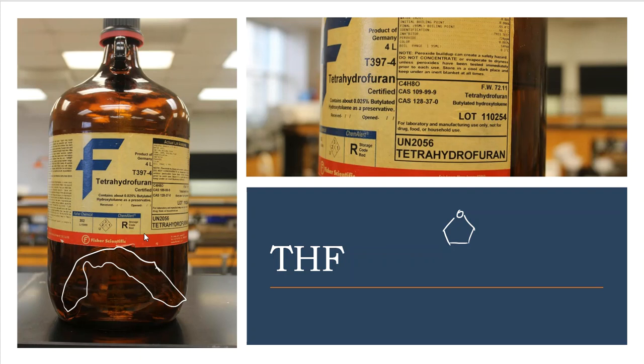Tetrahydrofuran, THF, came from Fisher Scientific, and the lot number, of course, is up here to the top right-hand side for you, so that way you can write that down when needed. The lab directions did do a pretty good job. They told me how much of this stuff to weigh out, or to use, or to measure. So this I did not have to calculate. There was no millimoles or anything like that. They just strictly gave me milliliters, and they called it a day.